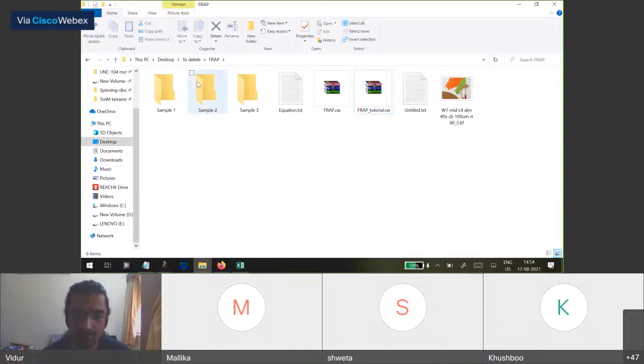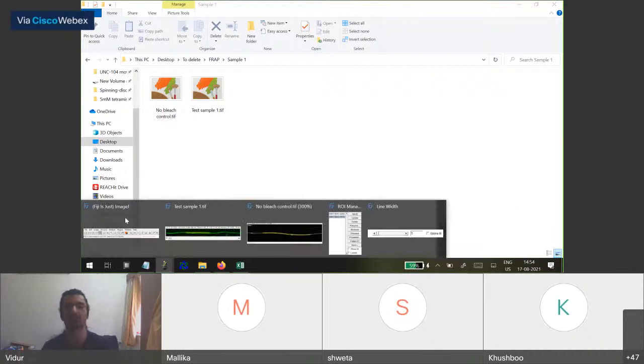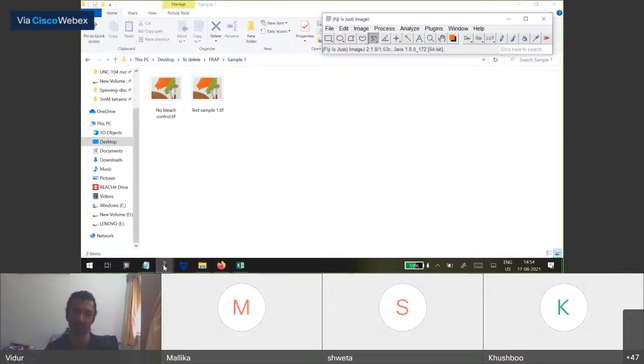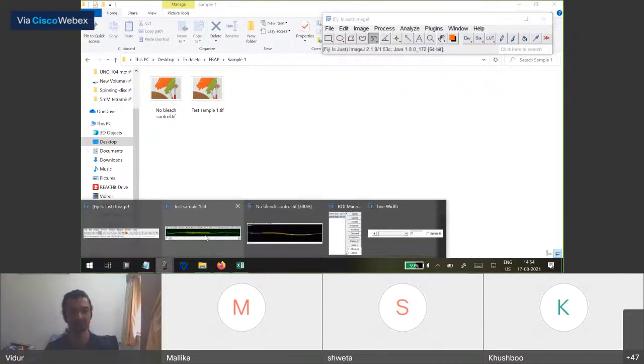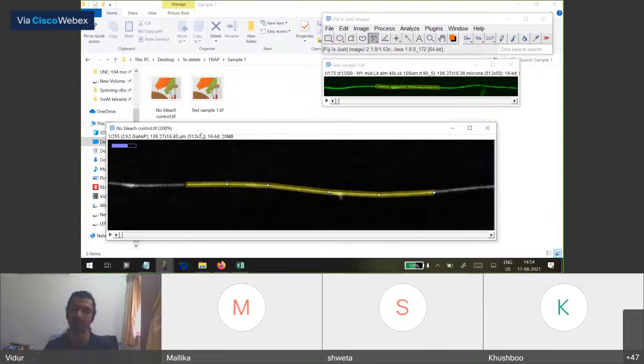Okay. Just let me know once you're done. Yeah, I'm done. Okay. So you can go on to the sample 1 folder. And there you'll see there's one test sample 1 and one no bleach control.